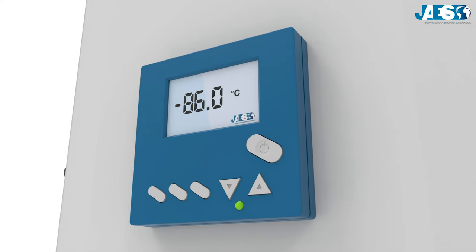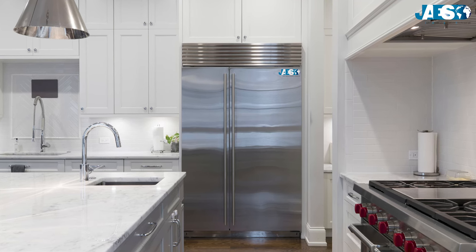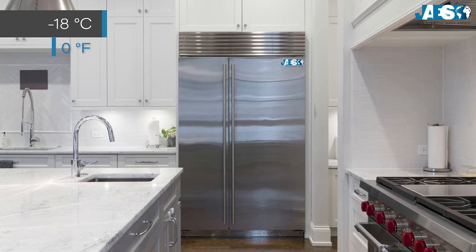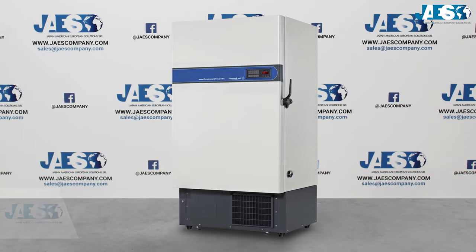These freezers are able to reach an incredible temperature of negative 86 degrees Celsius, or negative 123 Fahrenheit, which is very low when compared to standard refrigerators that come down to approximately negative 18 Celsius or zero Fahrenheit.